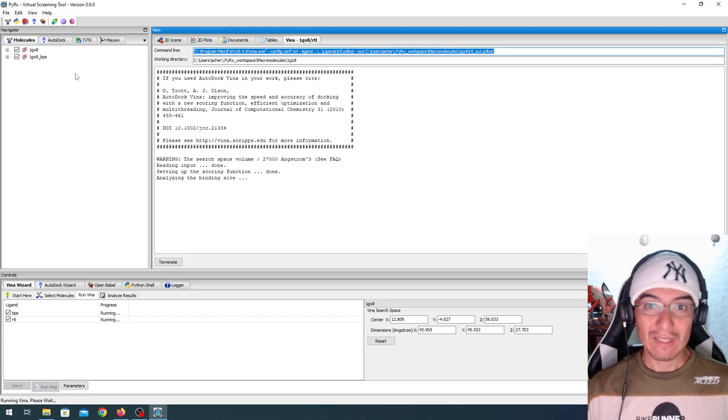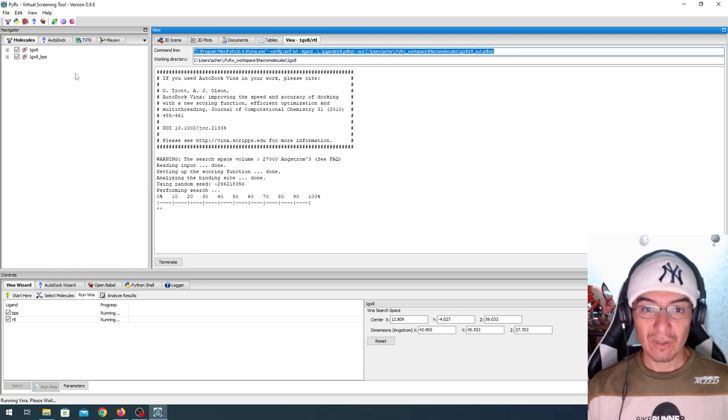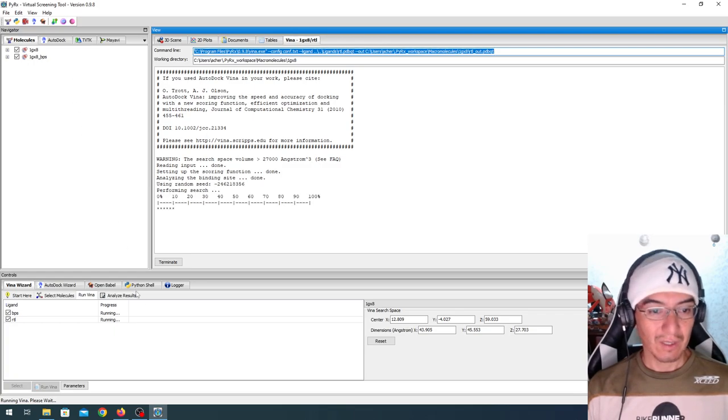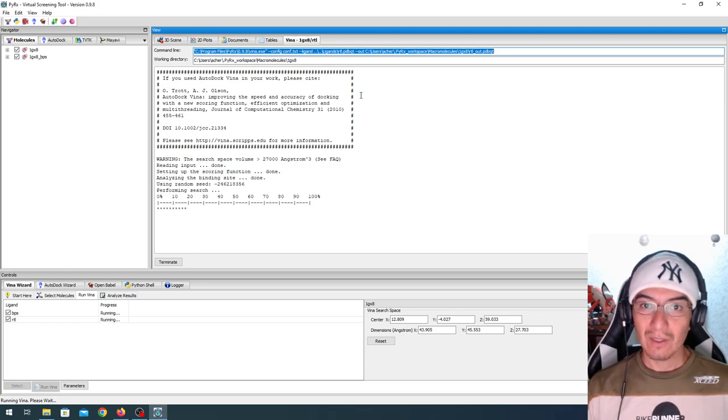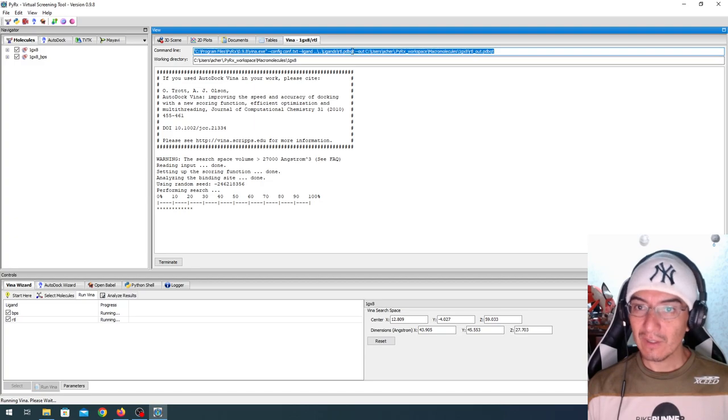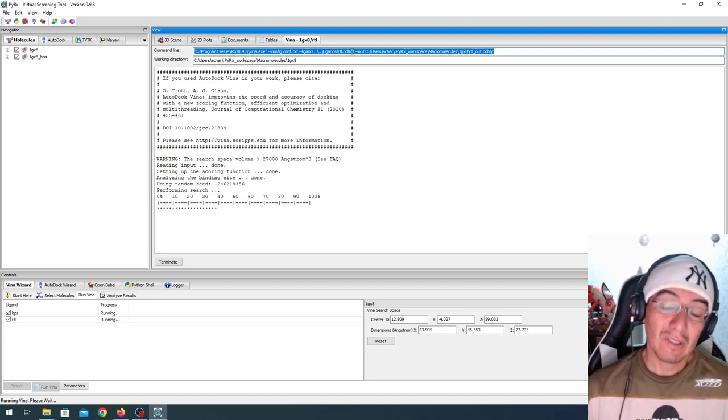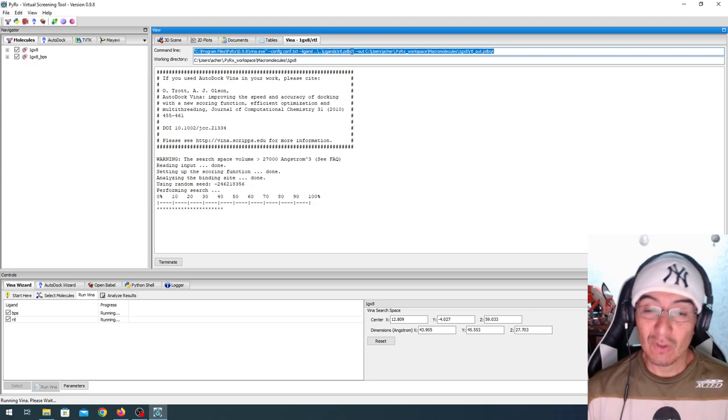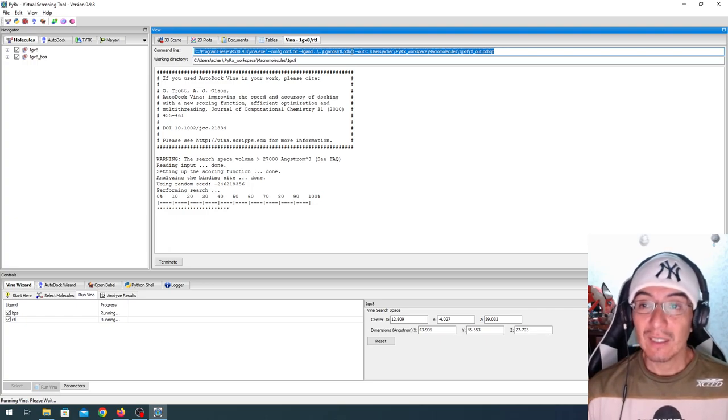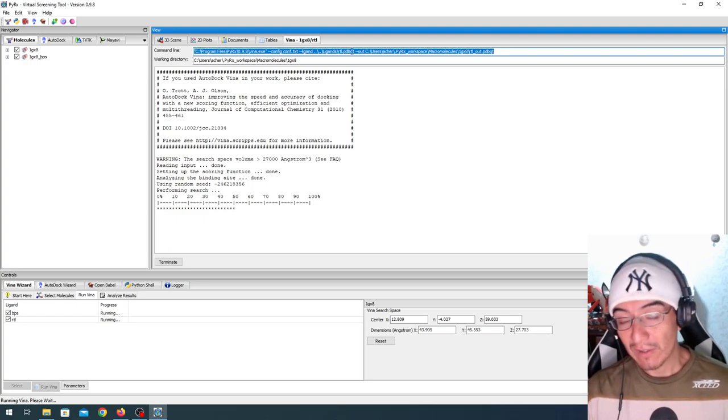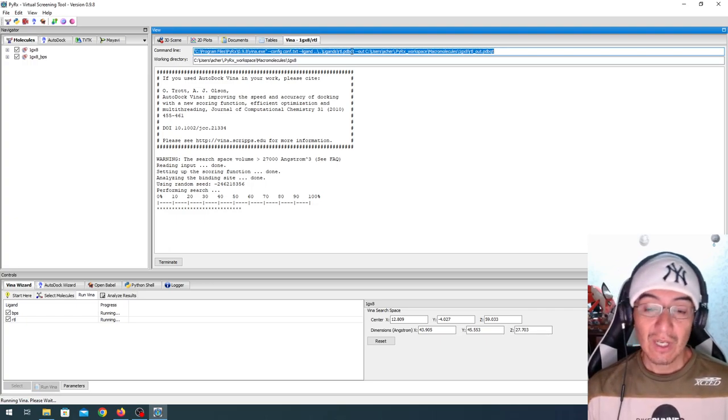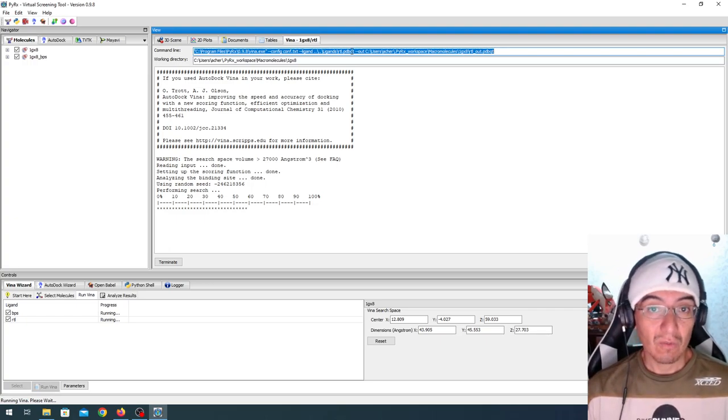We didn't even get to see the result. This is retinol. But as you can see, the preparation was super easy, minimum user intervention, and fast.